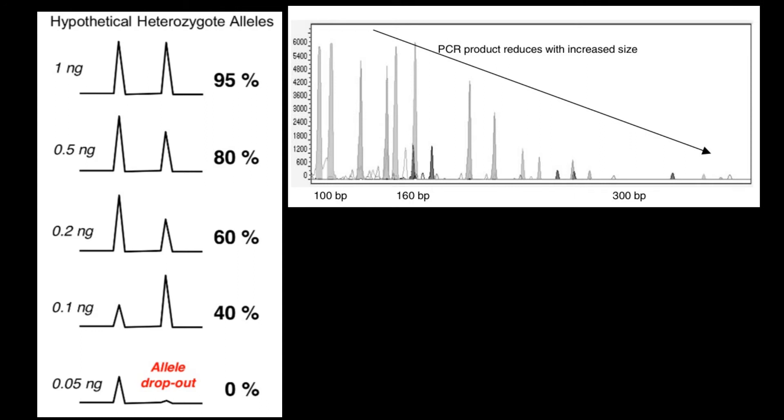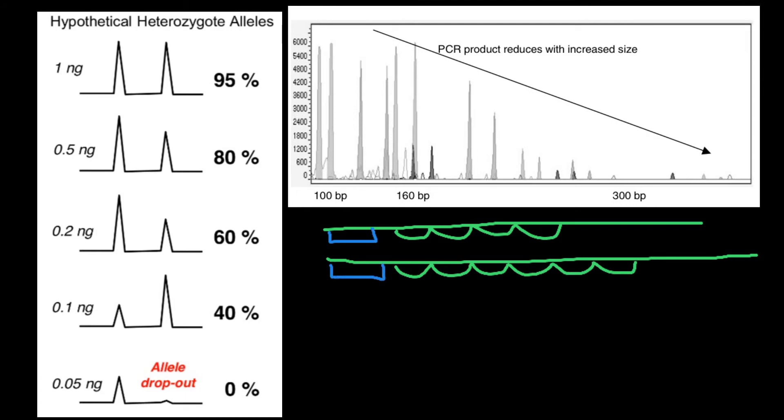And another mechanism would be, imagine now that we have template DNA here. Here's another template DNA. Here we have one, two, three, four repeats. Here we have one, two, three, four, five, six repeats. And let's say that here we would have primer one, primer two. And basically what we see for this locus, we see that this locus is heterozygous with different numbers of repeats. And this is what we see here.